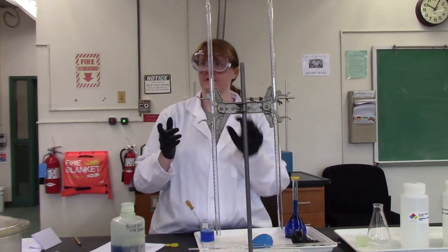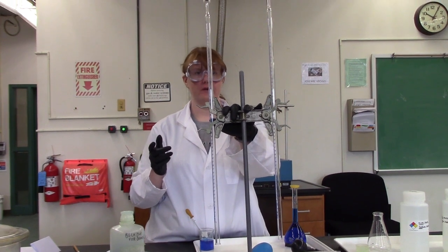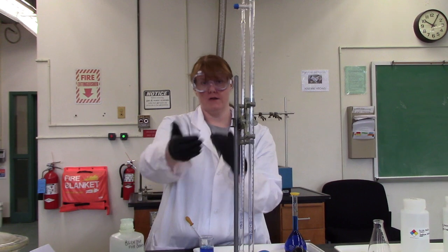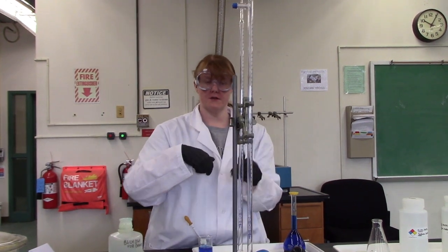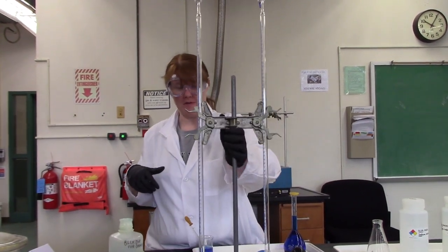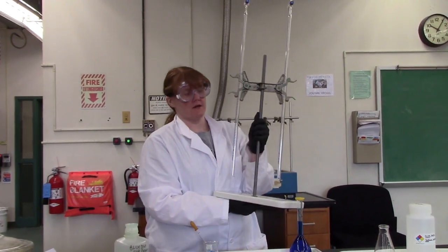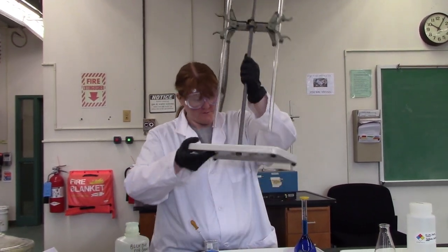You'll really only need one of them. They all come with 2 at a time, so if you're in a full lab, then what we can do is turn it sideways and you can share across the table from each other. If you don't have a full lab, I recommend getting your own and not sharing. It's a lot easier than reaching across the table.